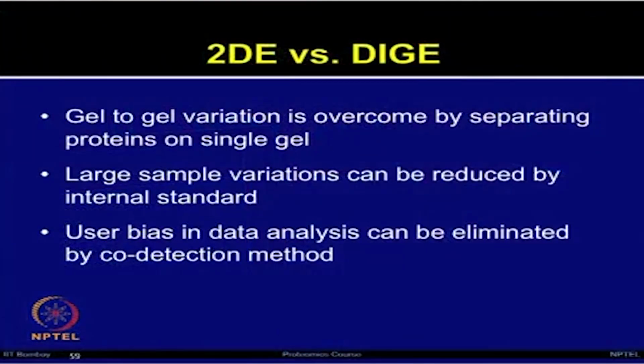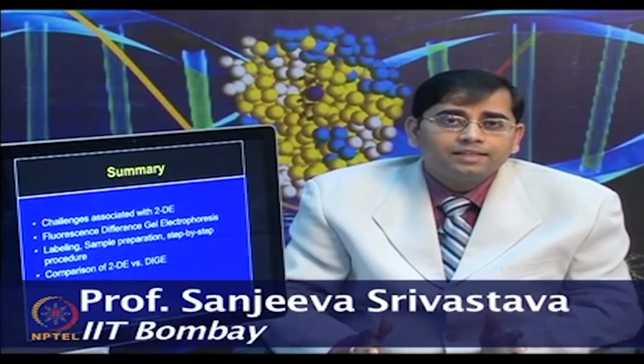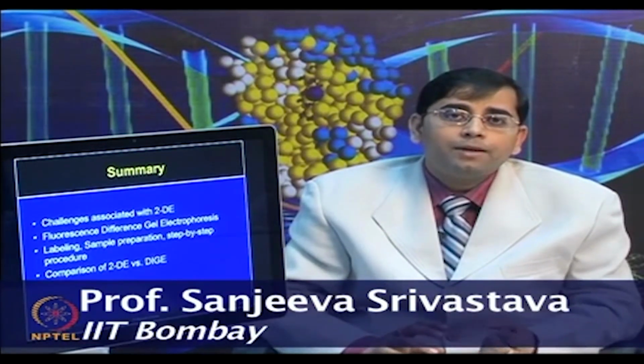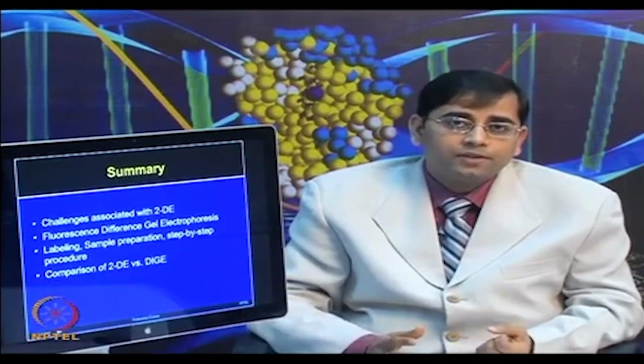So, overall if you compare 2DE and DIGE, there is definitely more merit in performing DIGE experiments, but before you move towards the 2D DIGE approach, first you need to ensure that your sample is good, your technique is working fine, and overall you can obtain a very good gel. So, first you need to perform a traditional or conventional 2D gel with Coomassie or silver stain to see whether everything is looking good, and then you can apply the same protein extract to perform the DIGE experiment. That will be very cost effective.